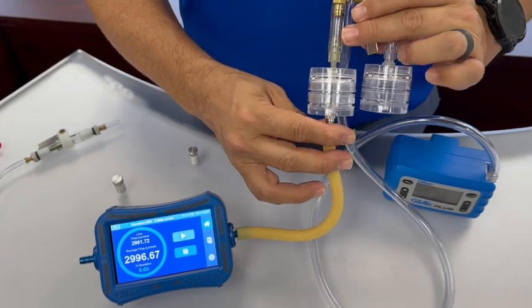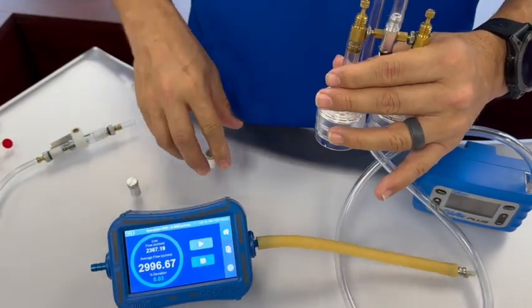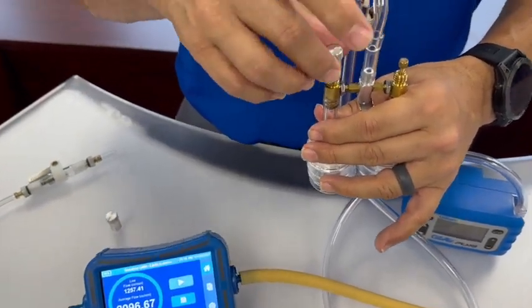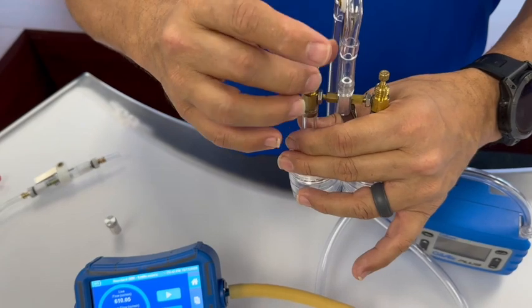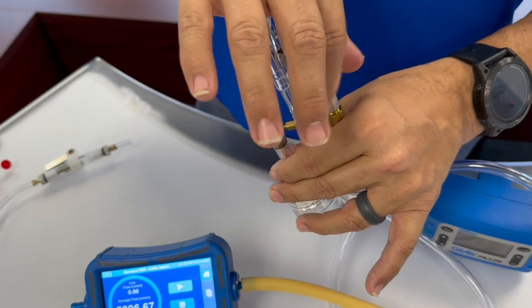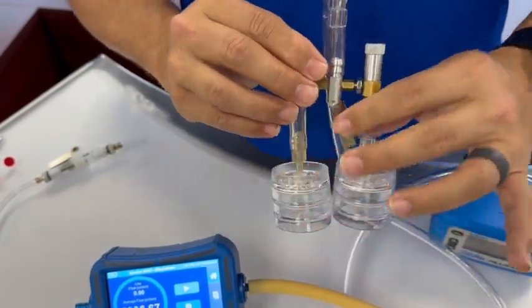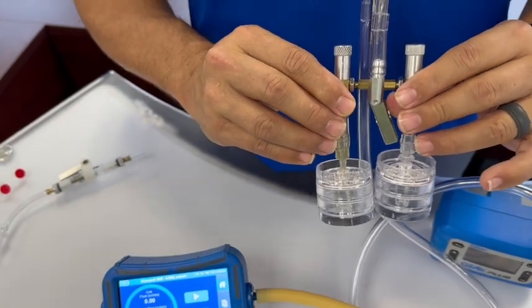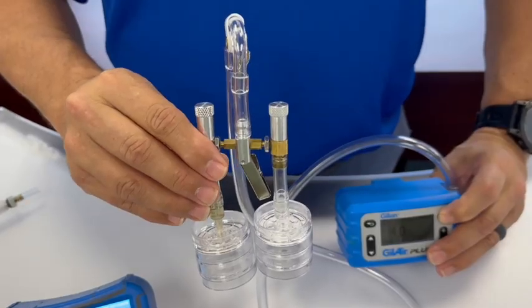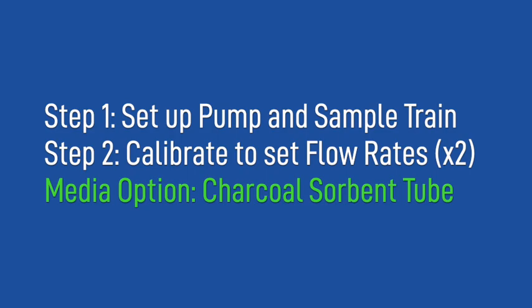Now that we've completed the calibration for both filter cassettes, we can disconnect the tubing to the calibrator and replace the tamper caps on both sides of the manifold. This will prevent the flow from being adjusted by the worker throughout the sampling event. You can now shut off the pump until you're ready to collect your sample.